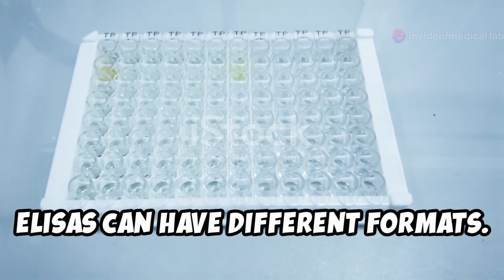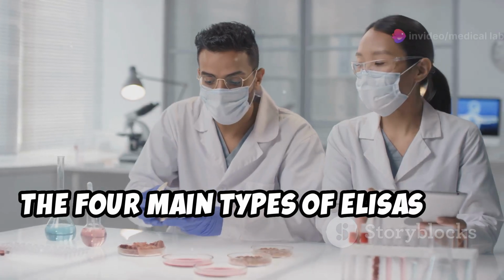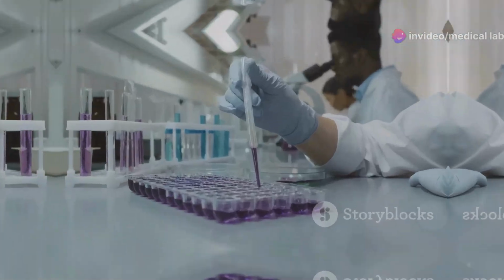ELISAs can have different formats. Types of ELISAs. The four main types of ELISAs are direct, indirect, sandwich, and competitive. Each type of ELISA has its own advantages and disadvantages.